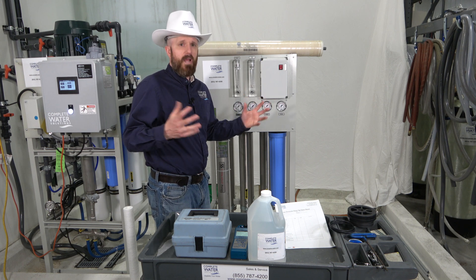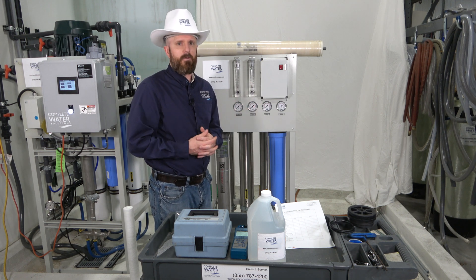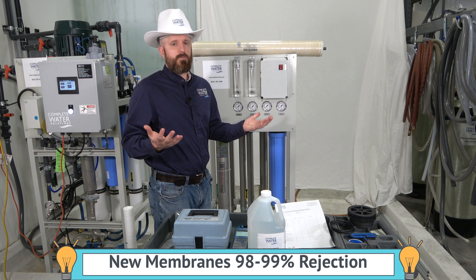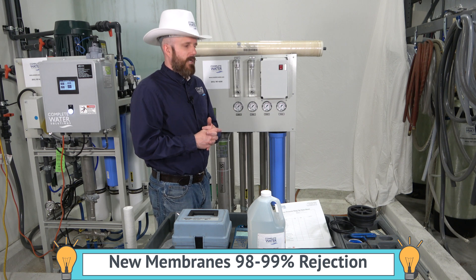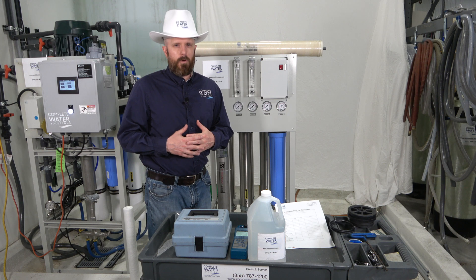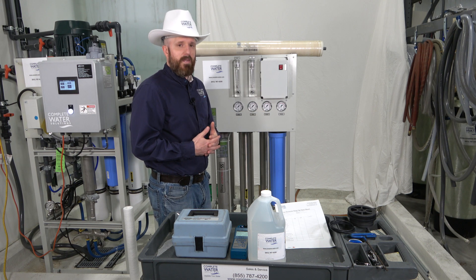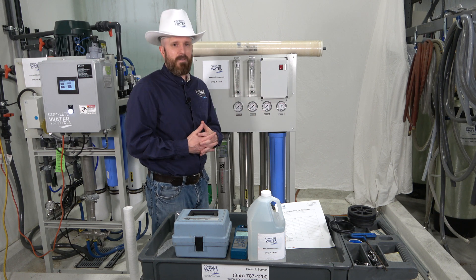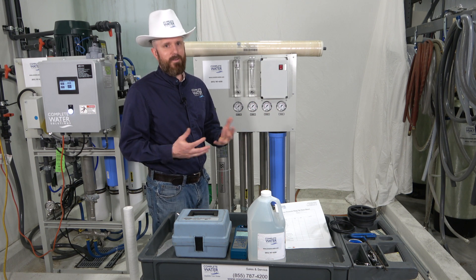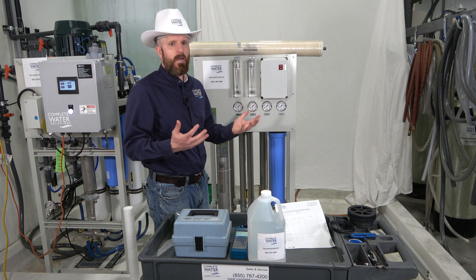For simple math: if you have 100 TDS coming into your machine and 2 TDS coming out, you're at 98% removal — or 98% rejection, as we call it in the industry. New membranes will typically output anywhere between 98–99% rejection. If your TDS coming in is 100 and your permeate TDS is coming out at 10, you only have 90% rejection — and that's not good. That's not what new membranes would give you, so you may have problems or it may just be time for cleaning.